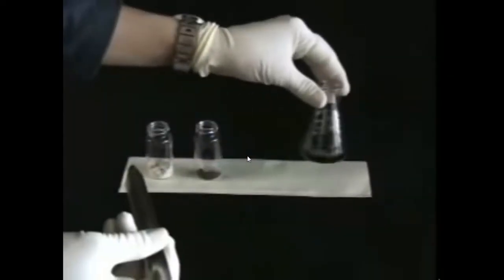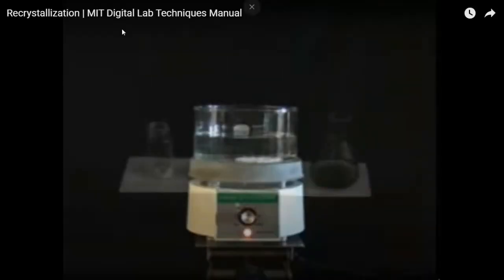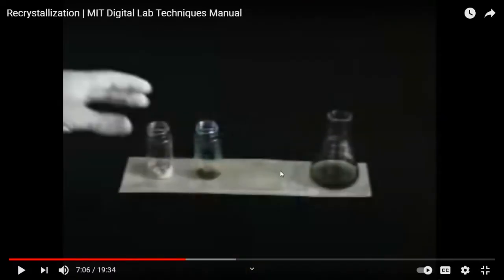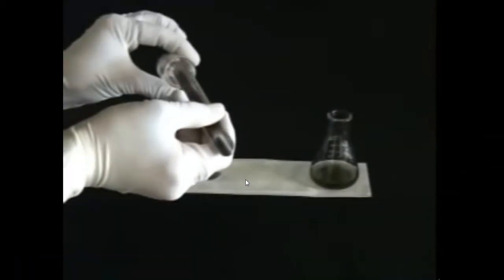Swirl the flask and boil it in the water bath for 2 to 3 minutes. So once the charcoal is in the solution, it's not going to fly, so you can boil again. Charcoal is very fine and can be hard to remove by filtration.